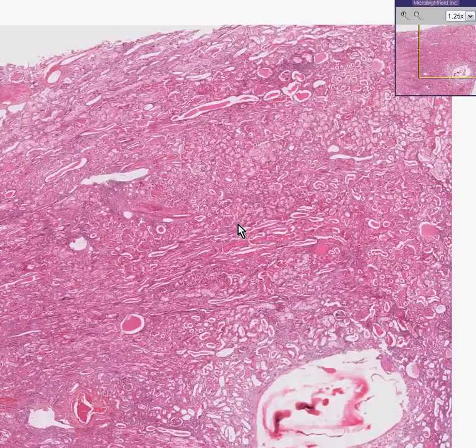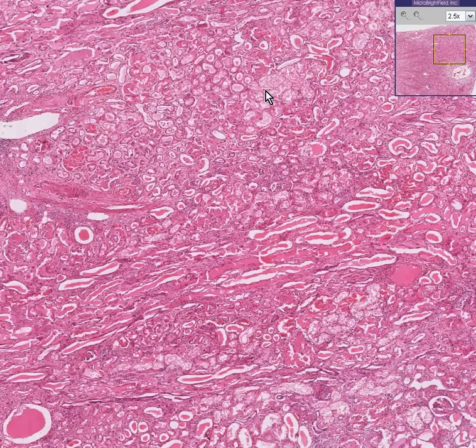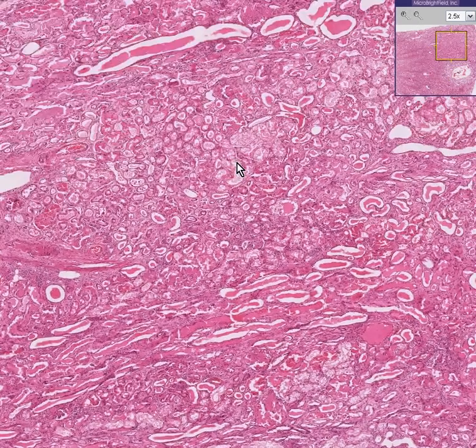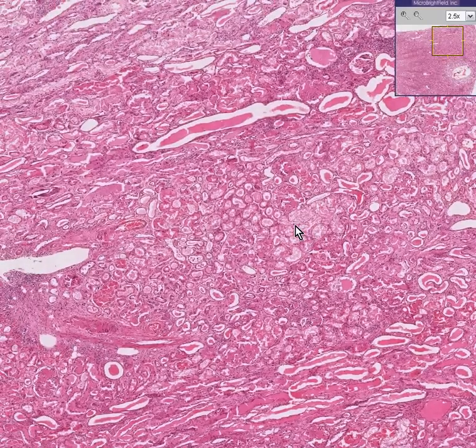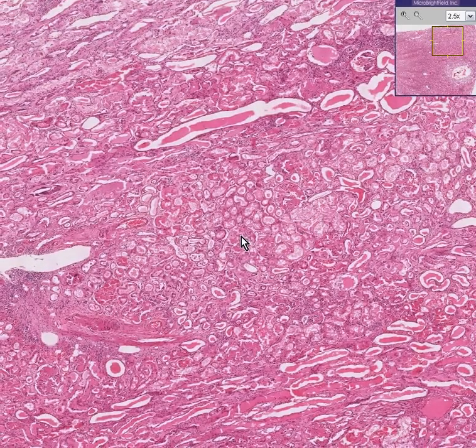What we can say about this case is that first of all, the tissue or organ involved is a kidney. You could see a whole variety of tubules here, and you could see some glomeruli.